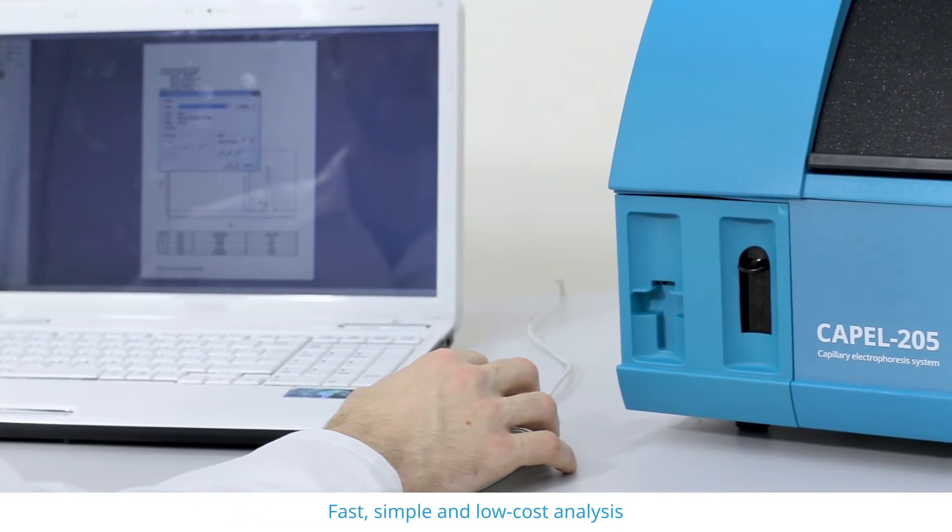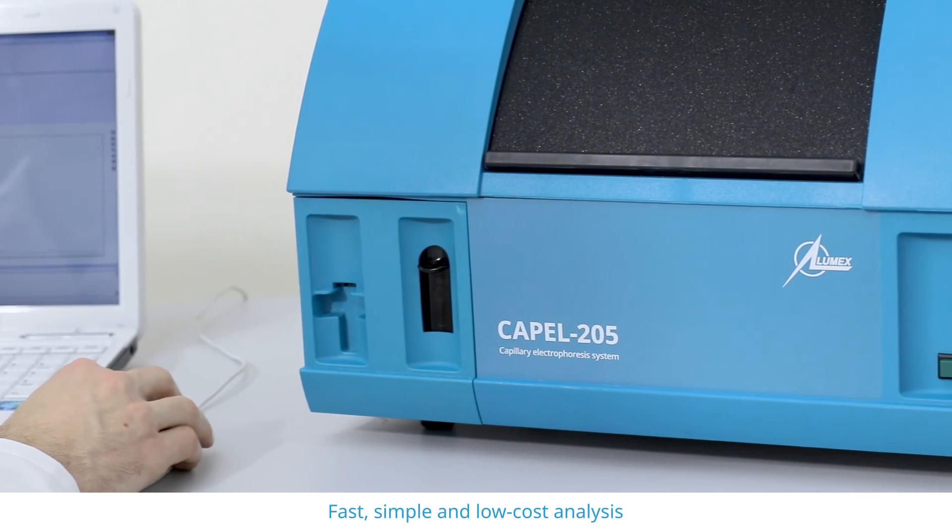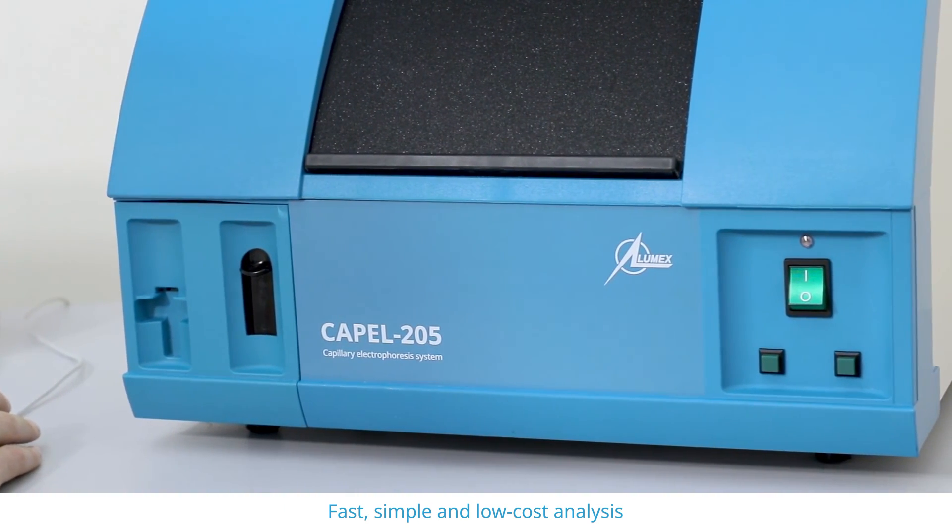Please visit our website to find out more about the instrument and method and make the right choice for your lab.